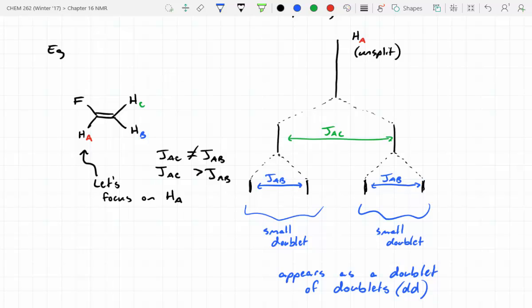A multiplet. So if you've got a really, really expensive NMR, sometimes you can tease apart the actual splitting pattern, but normally with your average quality NMR, it will blur so much that you'll observe just a multiplet. The one exception is doublet of doublets are observable even with relatively cheap NMRs, so you might see those occasionally. It's a weird phenomenon, but normally it only happens when the coupling constant is really, really different, and you see that often with alkenes. So what does that look like if you draw it out?